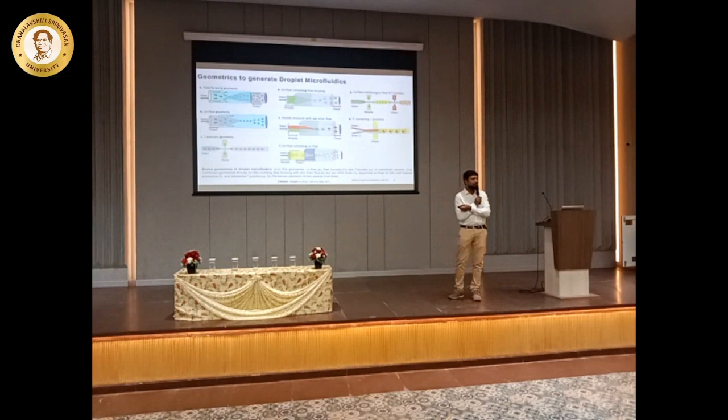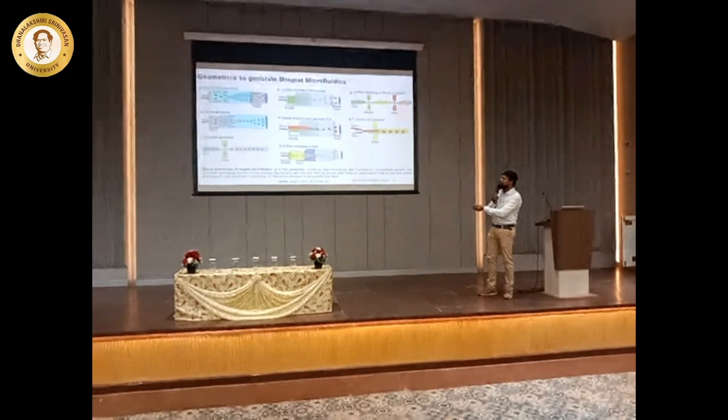Geometries are different. The droplet sizes can also be tuned. That's a fantastic thing, right? So you see a flow focusing geometry wherein you have the flow that's going to pass through it, and then it forms all these droplets here, and you have a co-flow geometry here, because what happens is this oil will squeeze here and it forms droplets here.